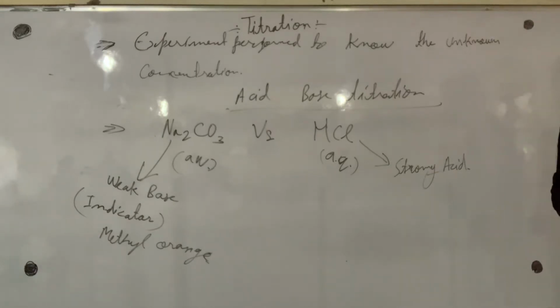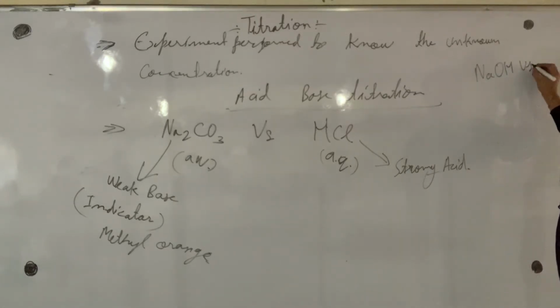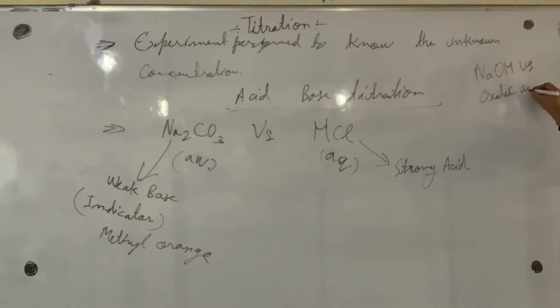Another titration that we can do, and this is in plus 2 standard also, is titration of NaOH versus oxalic acid.